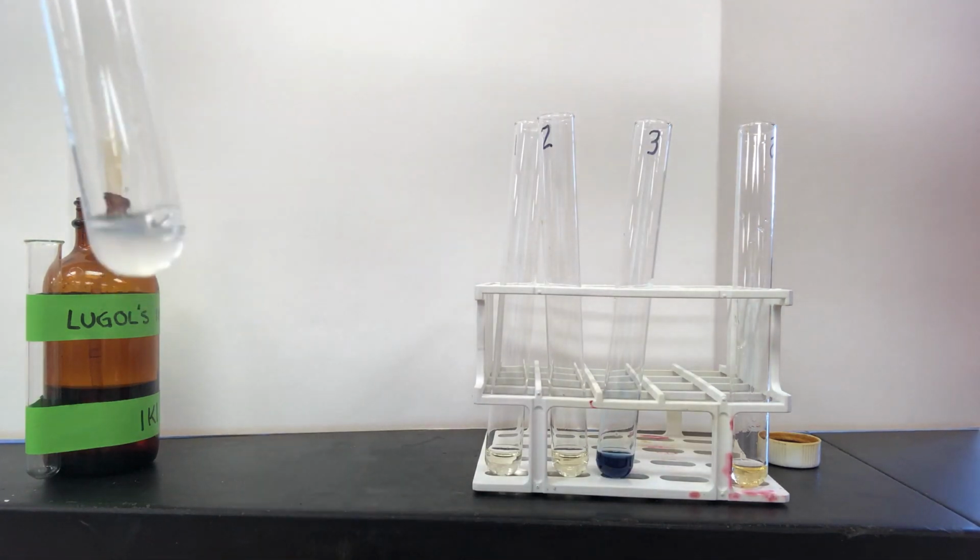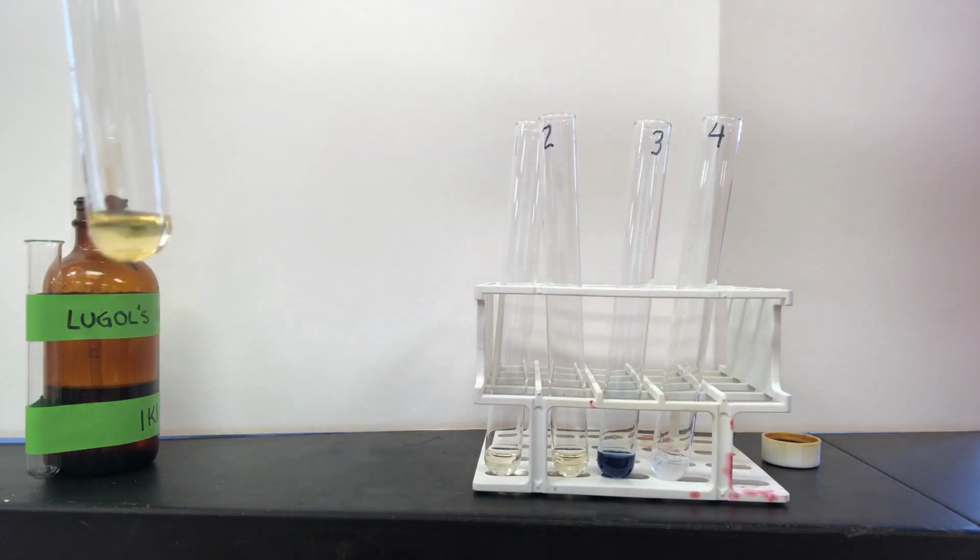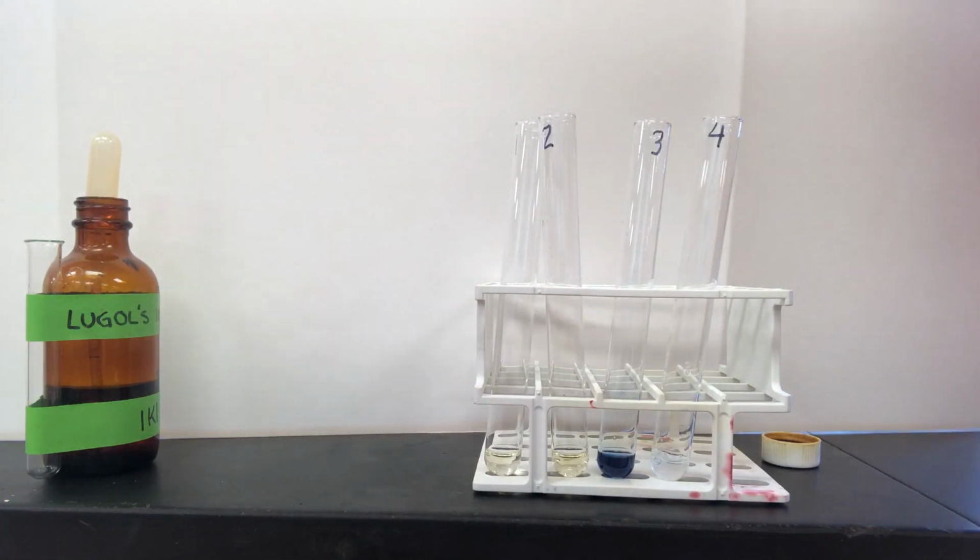This is what we would expect since starch is a polysaccharide. Therefore, starch would be a positive control. None of the other samples changed because none of them contained a polysaccharide.